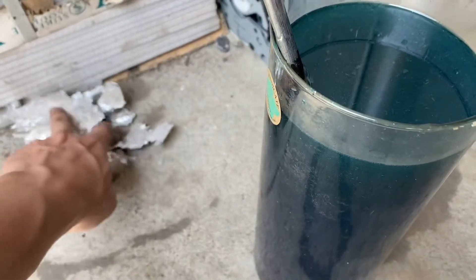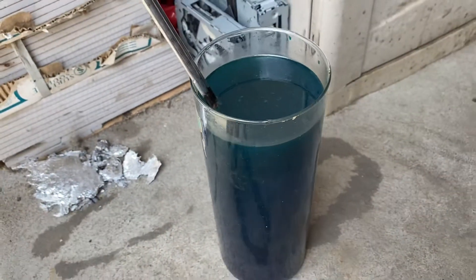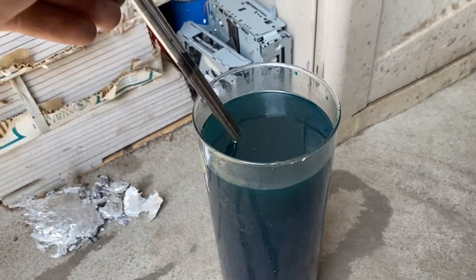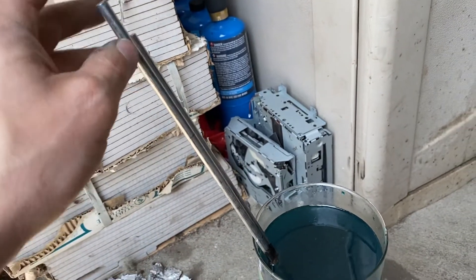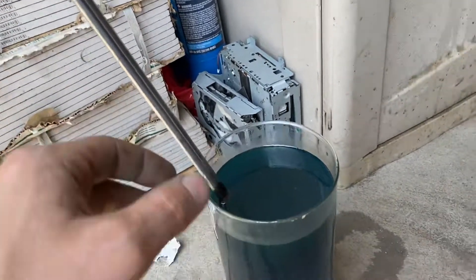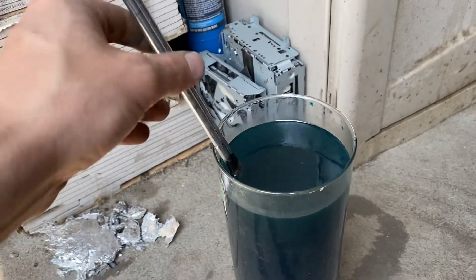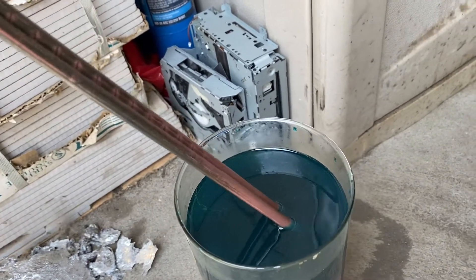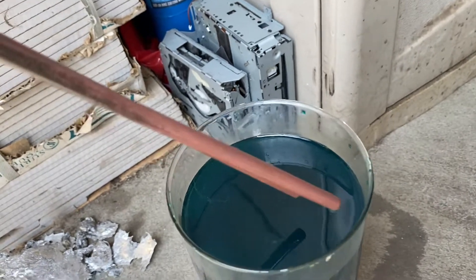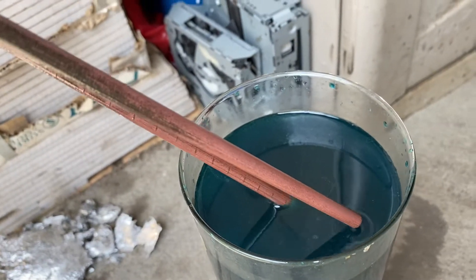This is just aluminum here from another day — I was melting that down. But as you can see, here's the steel. It was a rod I got for about two bucks, cut it in half, and put both pieces in here. It was all one color before, but as you can see, that copper color's coming in, and the further down you go, it gets real nice — real shiny copper.